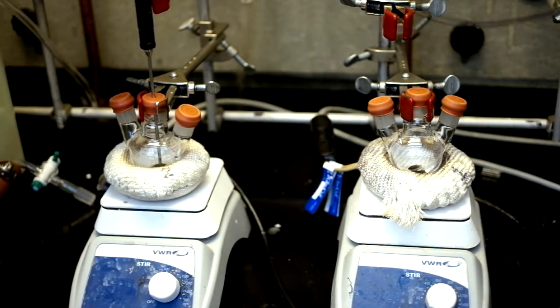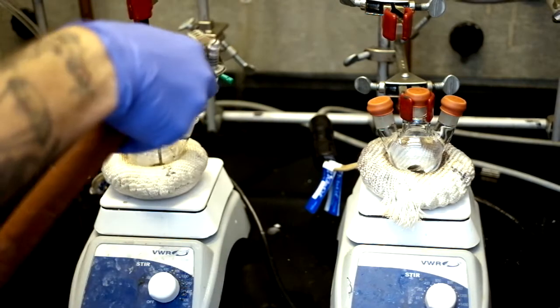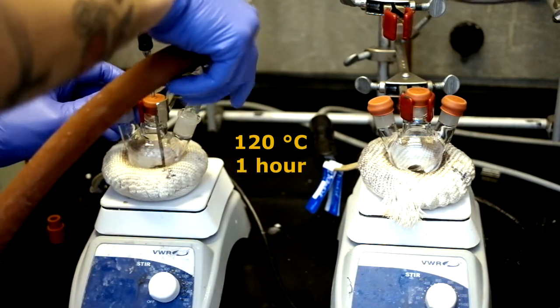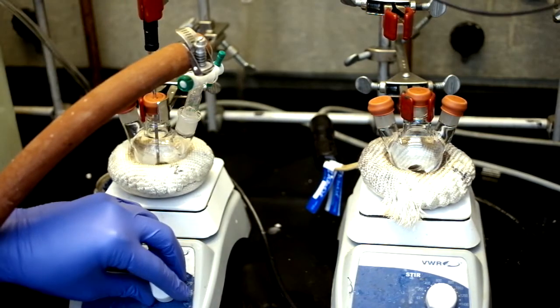Place a temperature probe in each of the two flasks, then place each of the two flasks under vacuum at 120 degrees Celsius for one hour, and then turn on the stir bars.